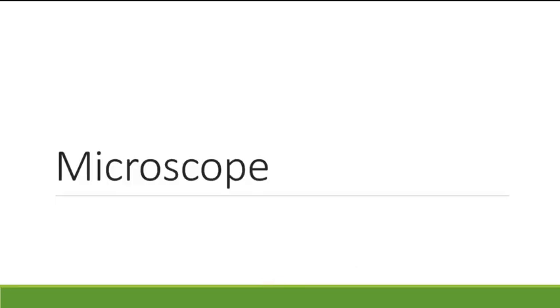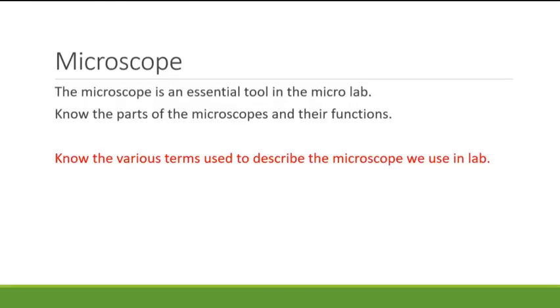This week in lab, we're going to look at the microscope. Now, the microscope is an essential tool in the micro lab. I do know a lot of you have experience with the microscope from previous courses, so we're going to use this week to review the parts of the microscope and their function.